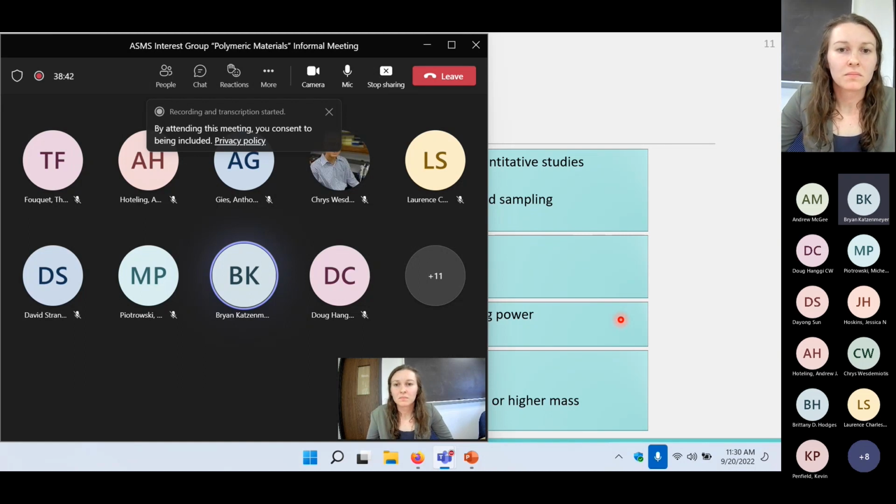So I'm just curious, as an industrial lab, whether Tony or anyone else on today's call would want to do this by MS versus traditionally doing it by size exclusion chromatography, getting the result from an Mn, and getting all your molecular weight distribution data that way.